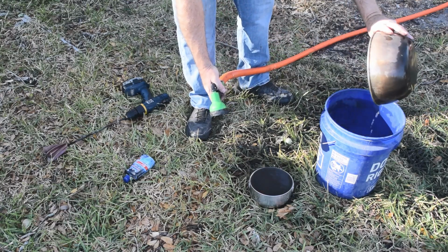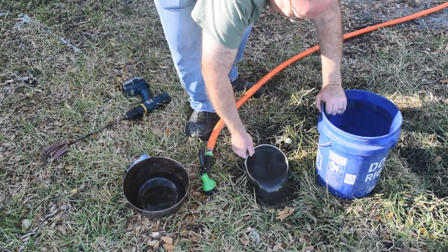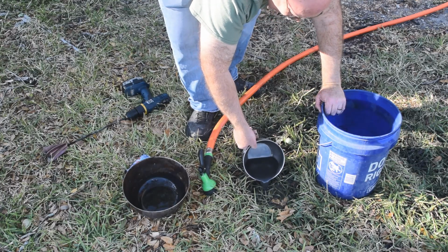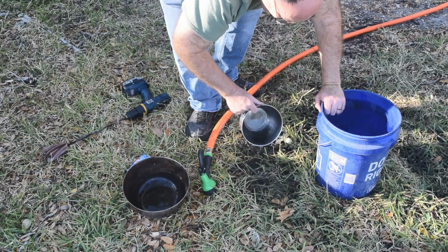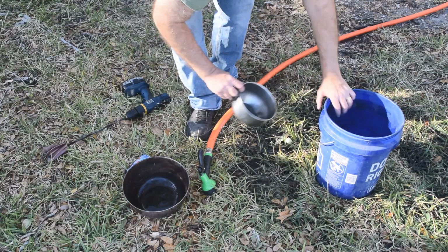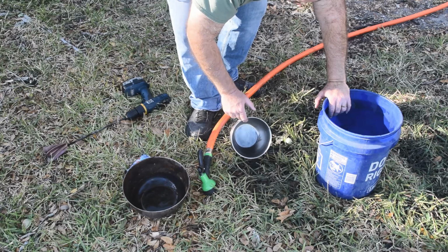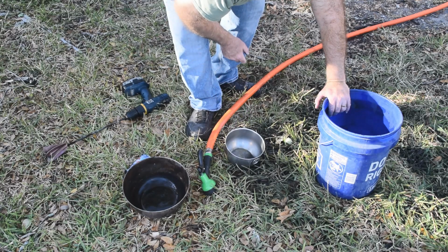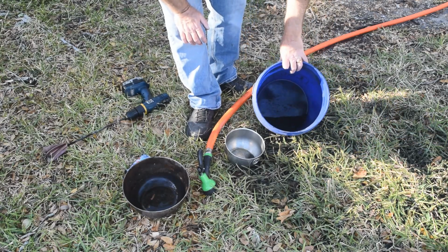All right. There we go. Let's see what's in here. Probably nothing of any consequence. Some very, very fine slime, which I'm not even going to put back in the blue bucket because I doubt there's any metal in that. If there is, it's not even going to move my scale. And that stuff's so fine, it's just going to clog my filters. All right. So let's get over to the fume hood with this stuff and get on with business.